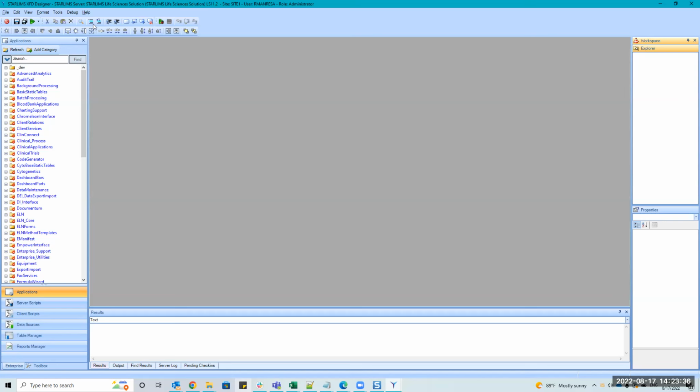designer itself, right? So each of you has a partition in the different designers, right? I think for some of the team it's much easier. The other ones have to go into the VM and all that. But bottom line, you have access to the designer. And once you have access, this is really the best training, right? Because everything you can think of in STARLIMS is here, and it's available, and you can read it. You can see how things are done.